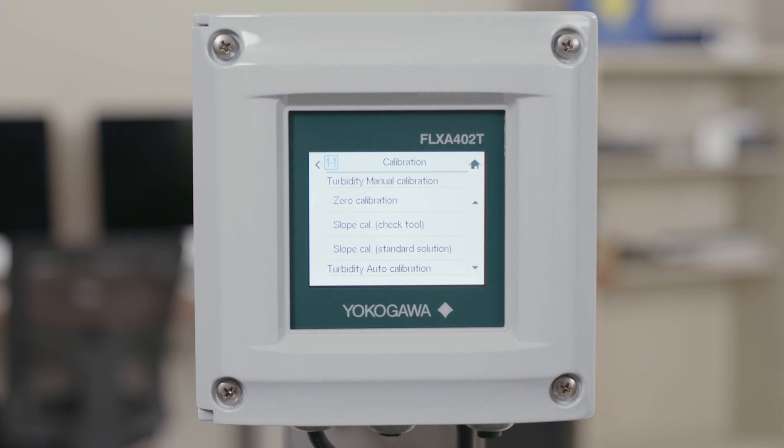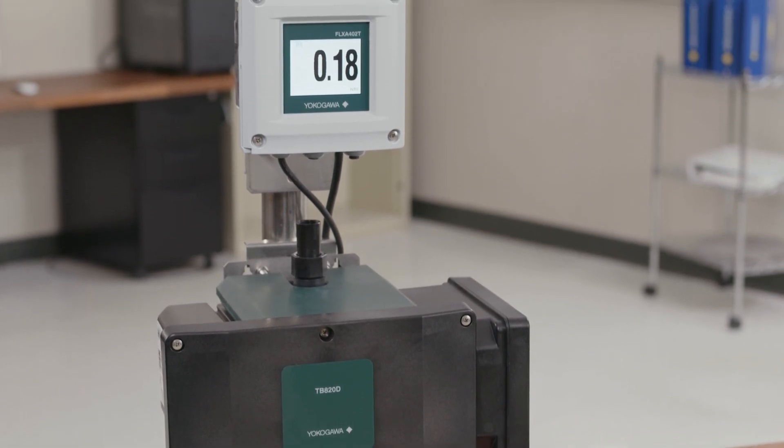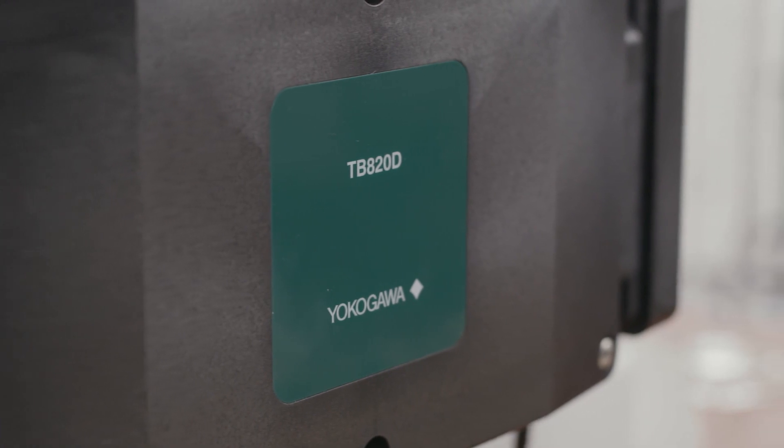From here you want to go ahead and move on to a span calibration in most cases, so do not take the analyzer out of maintenance mode just yet. For your span calibration there are two different kinds — one with our check tool which is included with the analyzer, and another with an NTU solution.